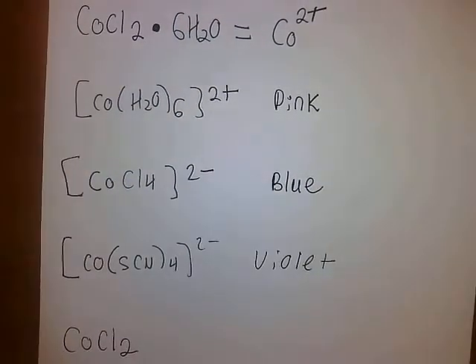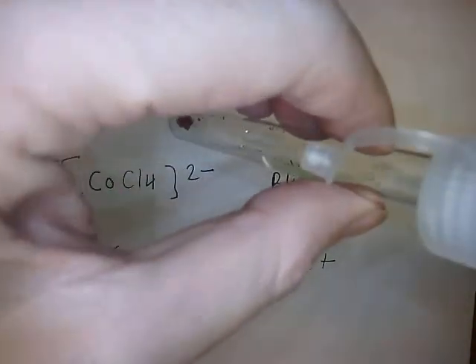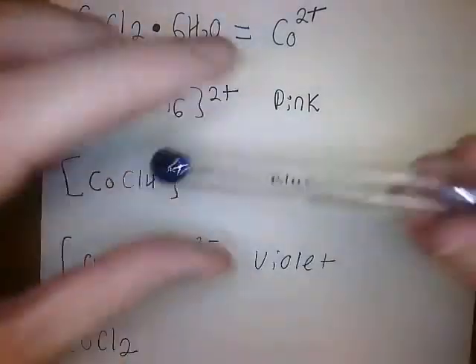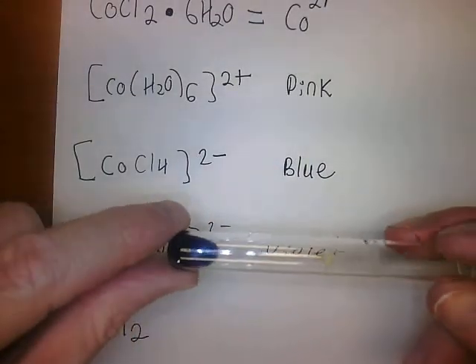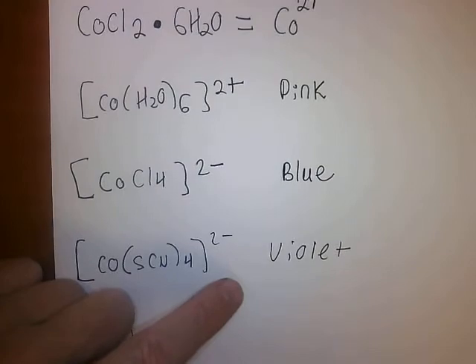Alright. So very similar, we're going to add some saturated potassium thiocyanate. So we know we get something that is somewhat similar, but this is definitely much more of a violet color than a blue. Okay. Now I should also note, well, we'll come back to that.